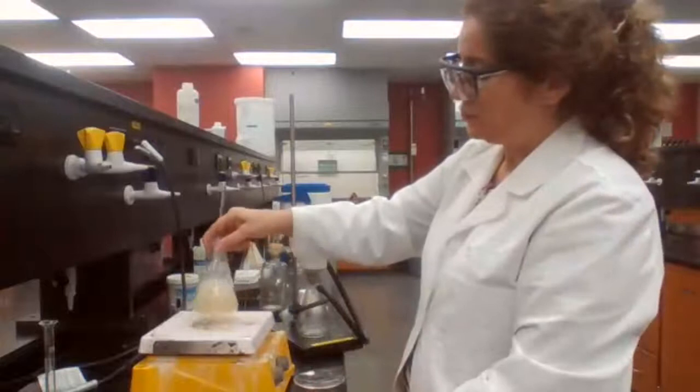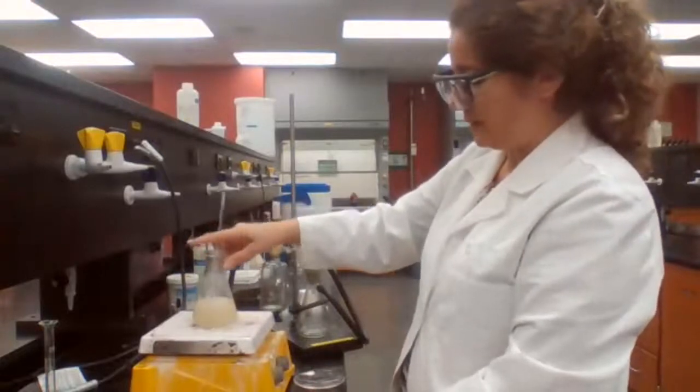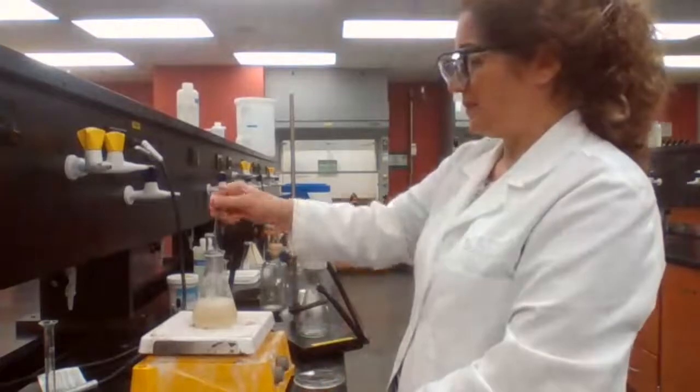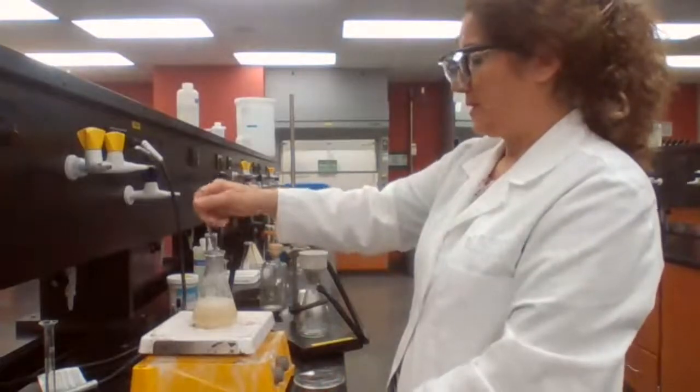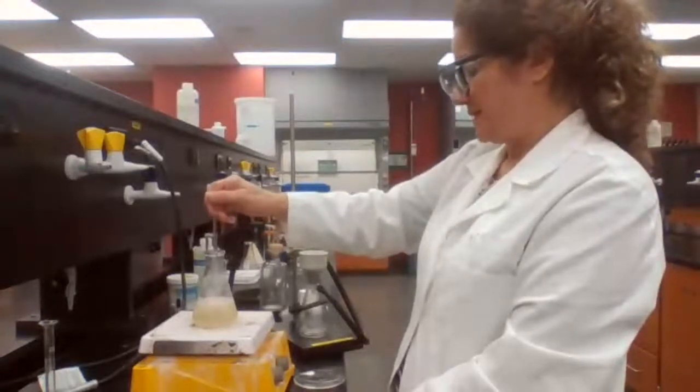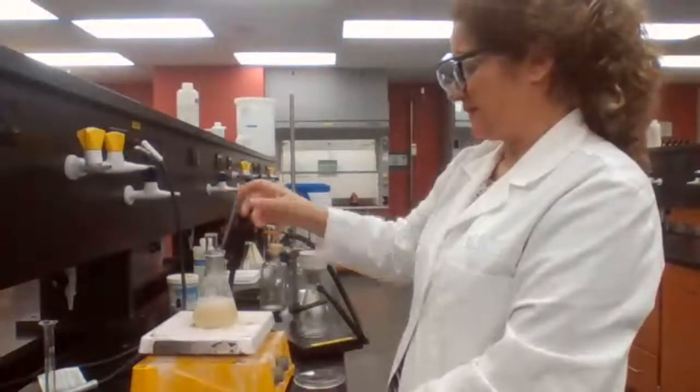I don't want my sample to foam out, so that's why I don't want to put too much heat, but at the same time, we need the sample to dissolve. So I'm setting up the hot plate between 7 and 8.